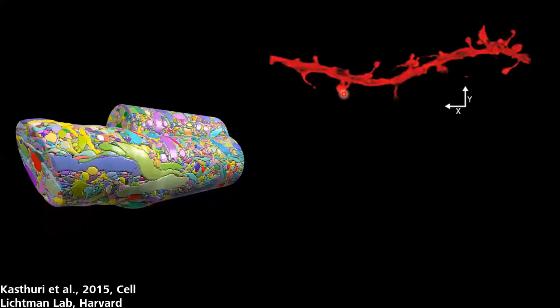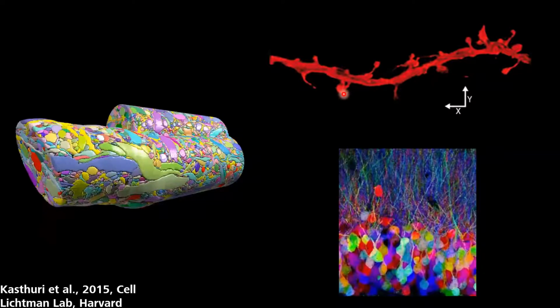But light microscopy, as great as it is, can only show what we are highlighting. That is the shortcoming, but at the same time the strength, because for what we are highlighting, we have a very good understanding of what we were using to tag that cell. And this is very exciting. But the second you overdo that a little bit, you end up with an image like that, where it's very difficult to see all the structures and allocate the right dendrite to the right cell body. So there are strengths and limitations on both sides. Electron microscopy, despite being able to cover huge volumes, is still very limited when it comes to identifying all the structures. And with light microscopy, you can pretty much only see what you're highlighting.